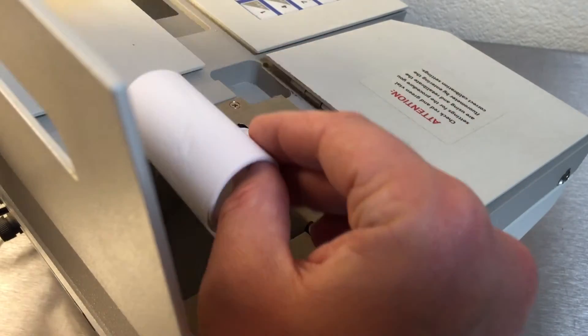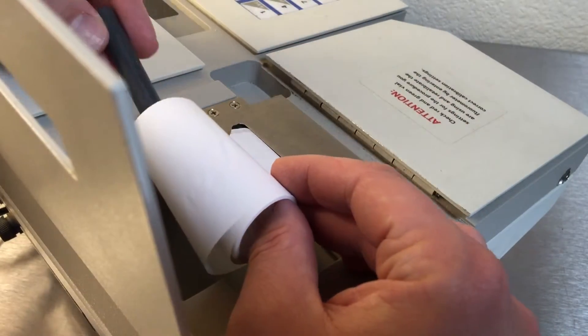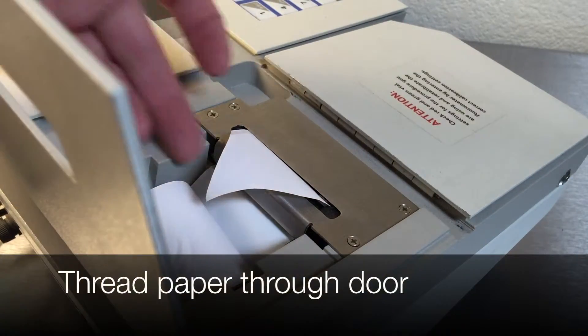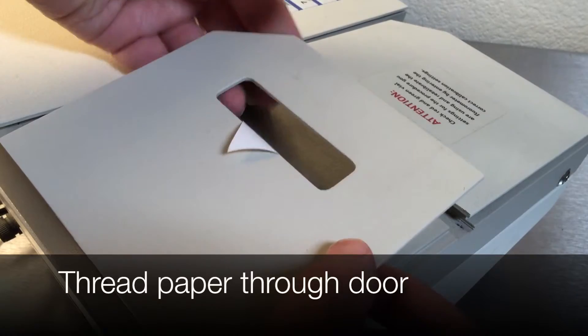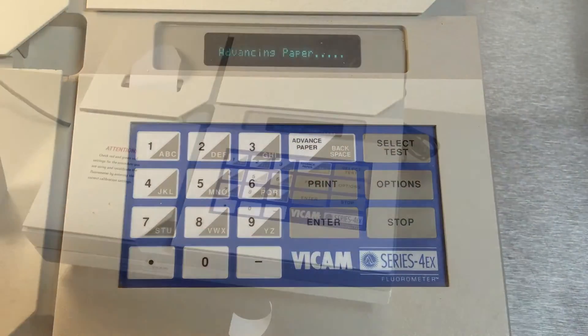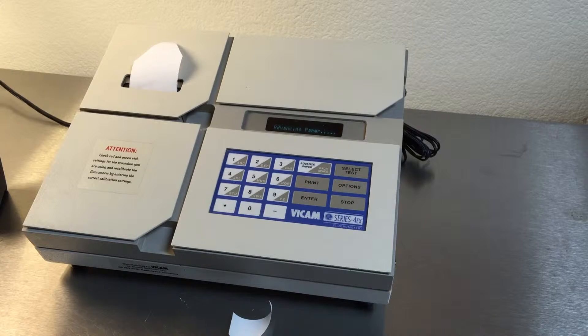Put the gray peg through the spool of paper. Gently place into the fluorometer and thread the paper through the door, closing the lid. Press advance paper to test that the paper is going normally through the printer.